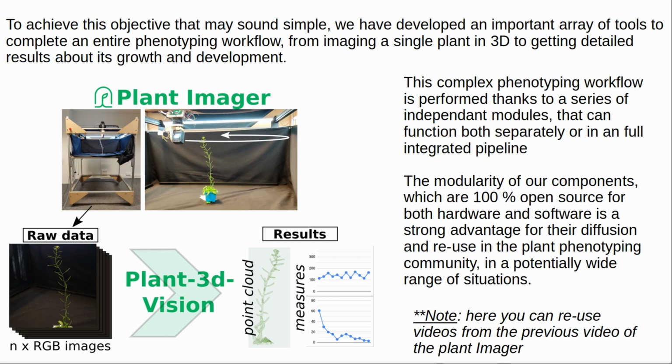This complex phenotyping workflow is performed thanks to a series of independent modules that can function both separately or in a fully integrated pipeline. The modularity of our components, which are 100% open source for both hardware and software, is a strong advantage for their diffusion and reuse in the plant phenotyping community in a potentially wide range of situations.